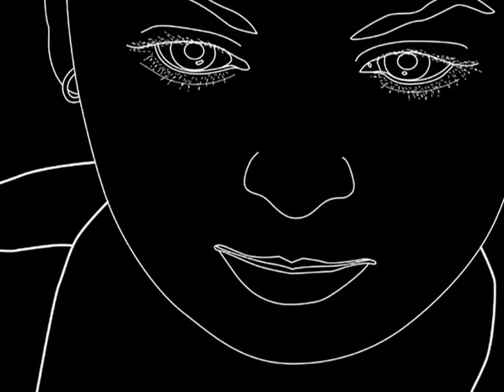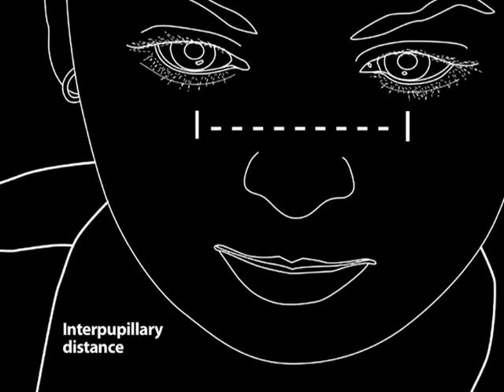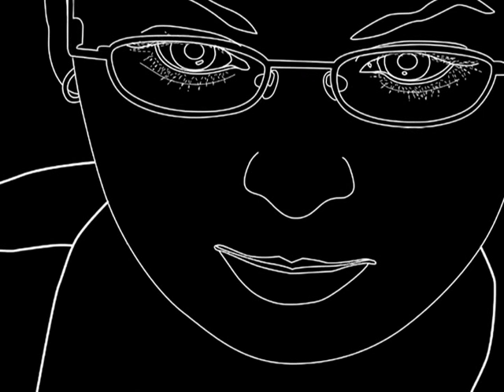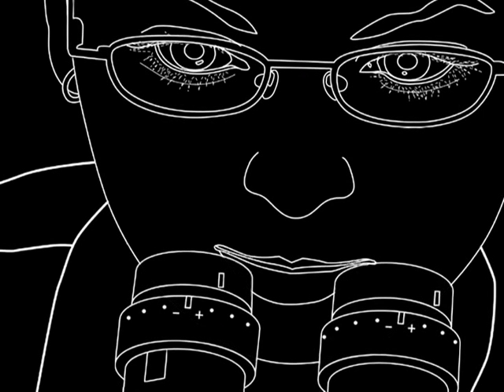The distances between people's eyes are not the same, and so for stereo microscope work, there has to be a mechanism to compensate. The distance between your eyes is called the interpupillary distance and is measured in millimeters. The usual range is between 50 and 70 millimeters. How to make your interpupillary adjustment will be explained later. Commonly, the right eye and left eye do not see equally well, even with eyeglasses. For binocular microscopes, you can adjust the ocular lenses for this diopter correction. How to do this will also be explained later.